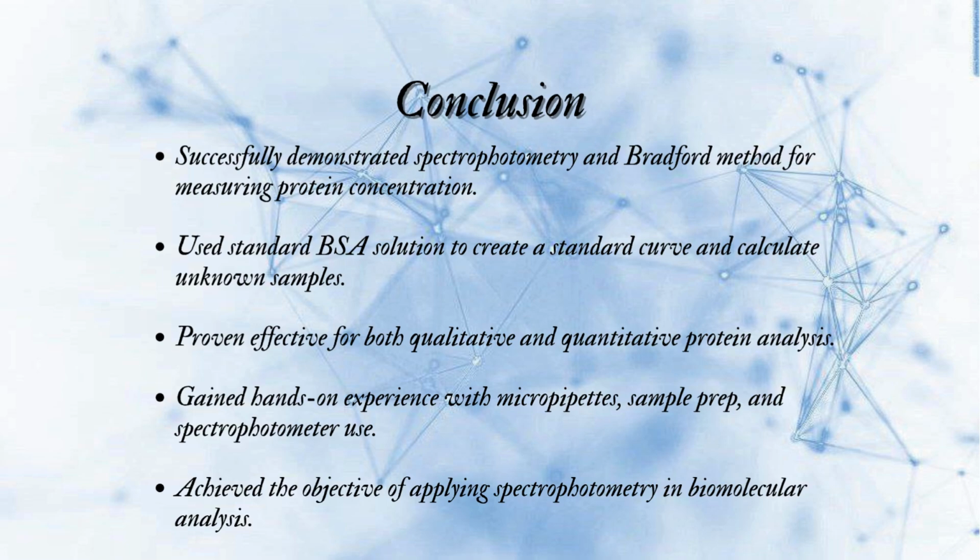To conclude, we can successfully demonstrate spectrophotometry and the Bradford method for measuring protein concentration, then use standard BSA solution to create a standard curve and calculate unknown samples. This is proven effective for both qualitative and quantitative protein analysis and gain hands-on experience with micropipette sample prep and spectrophotometer use. Lastly, we can achieve the objective of applying spectrophotometry in biomolecular analysis.